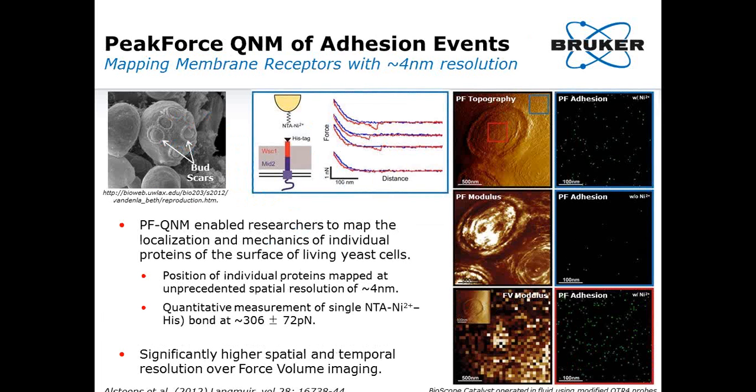In another example of molecular recognition imaging, researchers used PeakForce QNM to measure the localization and mechanics of individual proteins on the surface of live Saccharomyces cerevisiae cells. Living yeast cells were immobilized in a polycarbonate membrane and imaged in buffer solution.